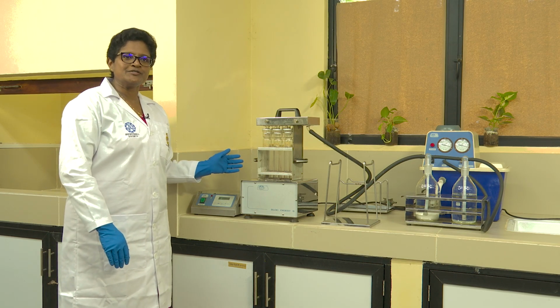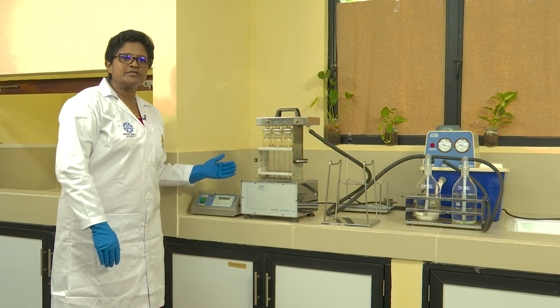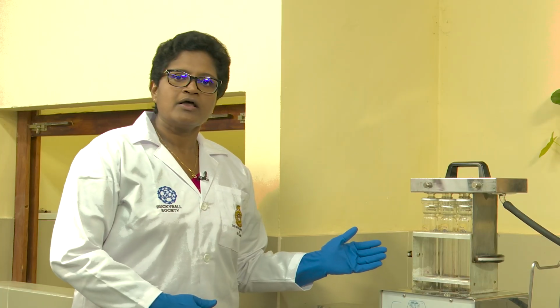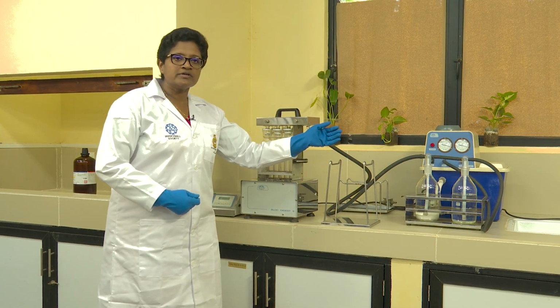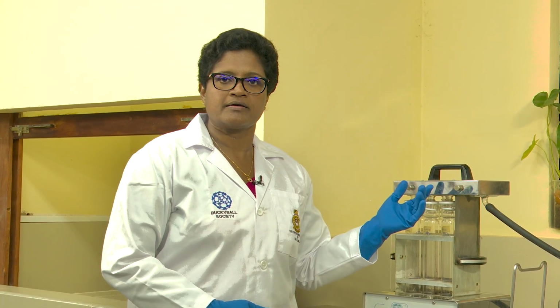This Kjeldahl instrument consists of 3 main units. The first unit is the digestion unit, where the digestion is taking place, which is connected with the scrubber unit. The purpose of having the scrubber unit is to neutralize all the harmful gases evolved from the digestion process.